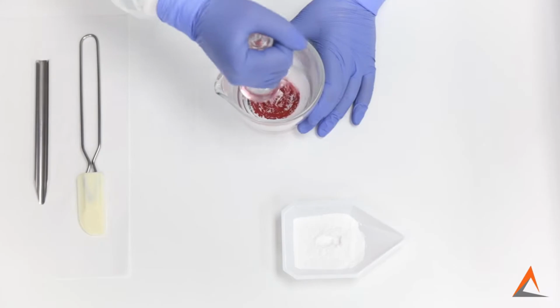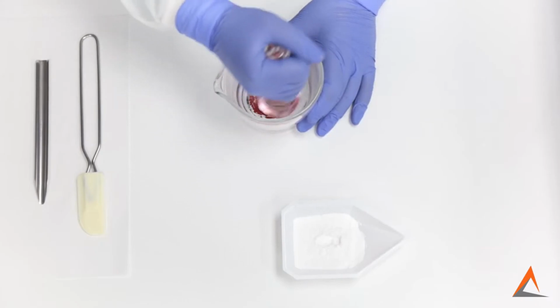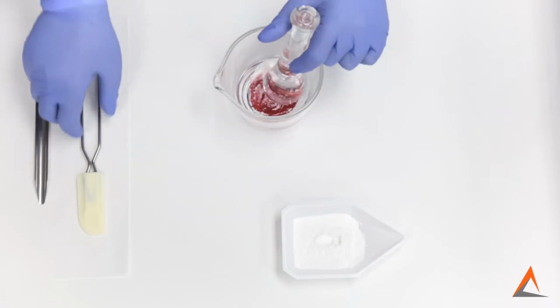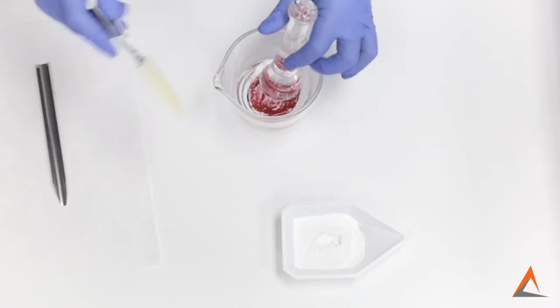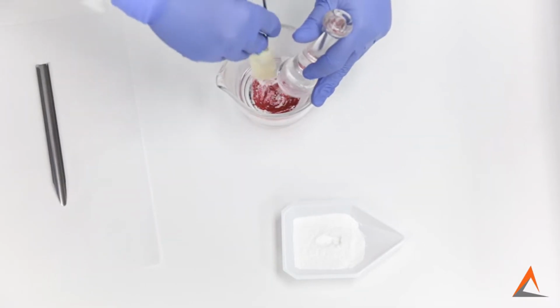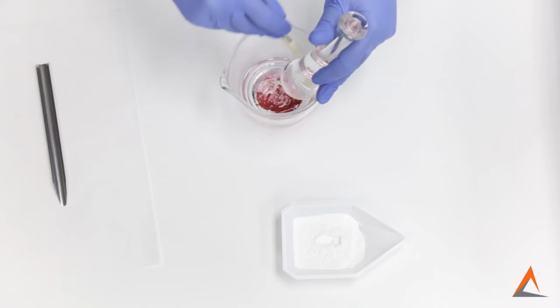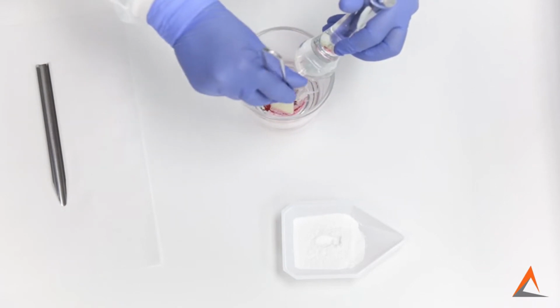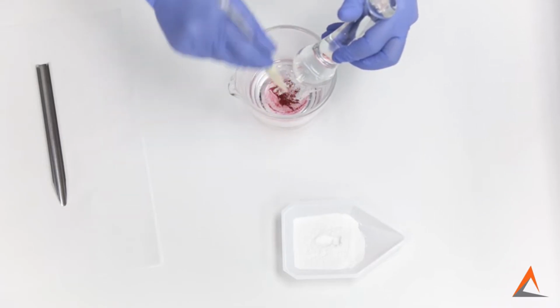While triturating, we're mixing our powders very well, but also trying to reduce particle size to get a fine, homogeneous powder. After each mix, we're going to scrape down our pestle and the sides of our mortar and collect the powder in the center of our mortar.